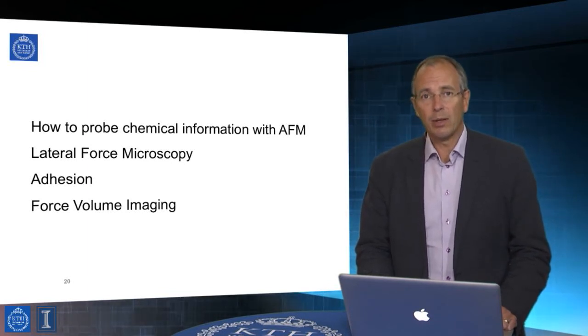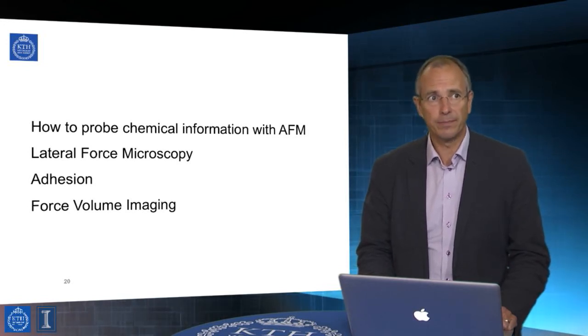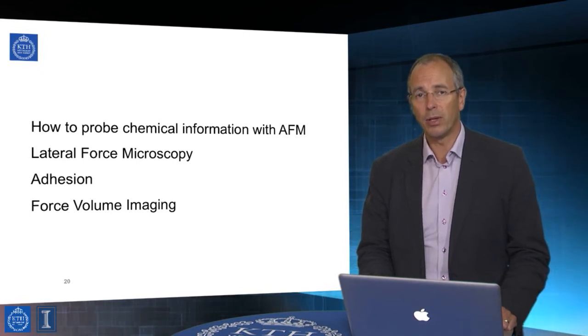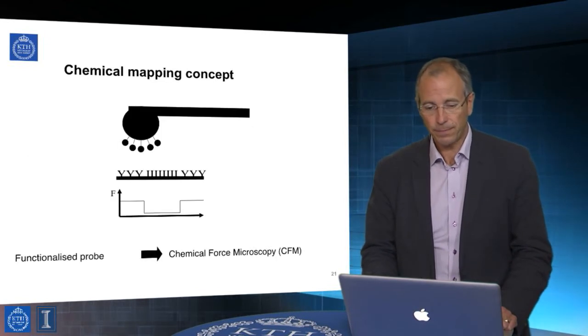Force volume imaging is a technique which has traditionally formed part of this armory, but over the last 3 to 4 years, this being 2014, that technique has been superseded by a host of far more high-resolution material properties imaging techniques, which we'll discuss instead.